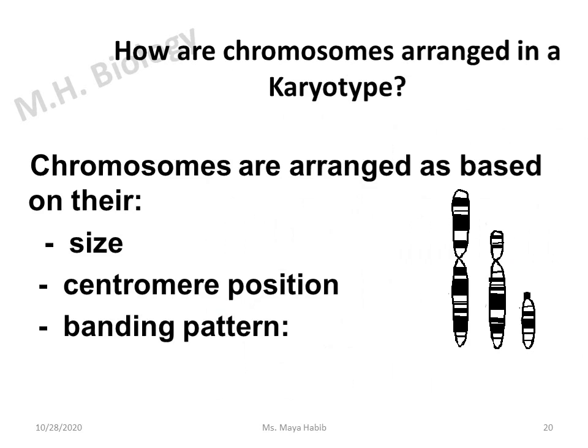Specialized stains or dyes produce unique banding patterns along each chromosome, that is, the chromosome can be stained to be seen in either black and white, or in colors. Banding patterns are extremely helpful for detecting any abnormality in the chromosome structure. See in this figure, the dark and light bands, or the black and white lines along each stained chromosome.